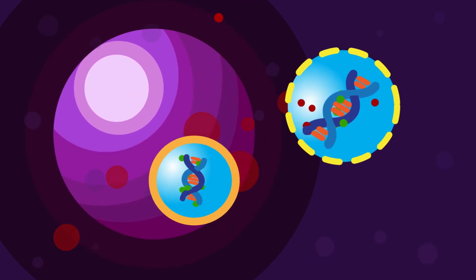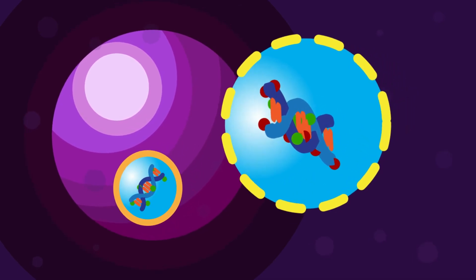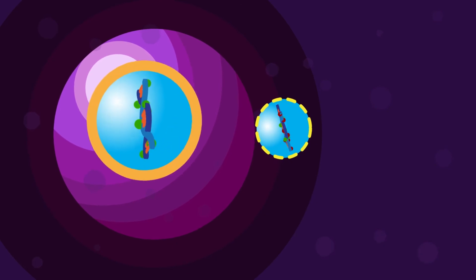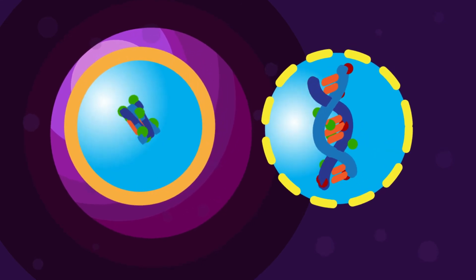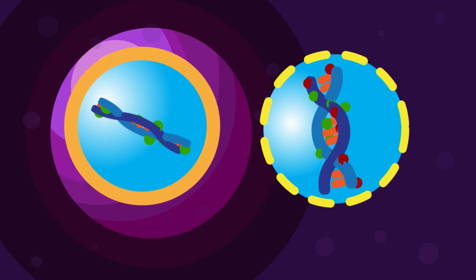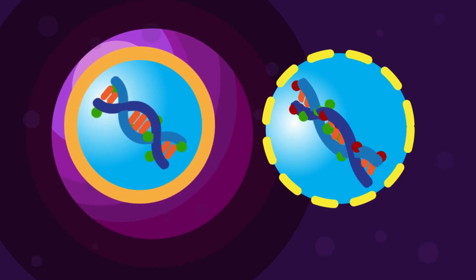Red dye is a membrane-impermeable dye that can only enter dead bacteria with loss of membrane integrity but cannot enter live bacteria with an intact membrane. By measuring both green and red fluorescence inside the bacteria, flow cytometry can distinguish live and dead bacteria and report the number of live bacteria as the viable cell count.